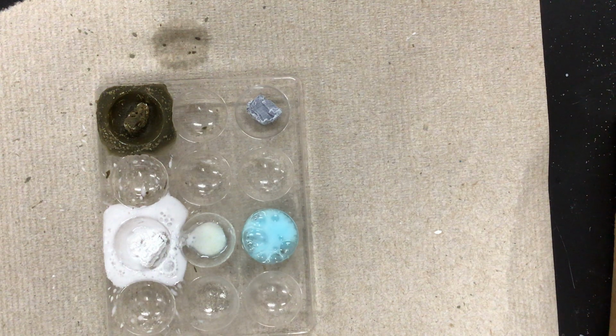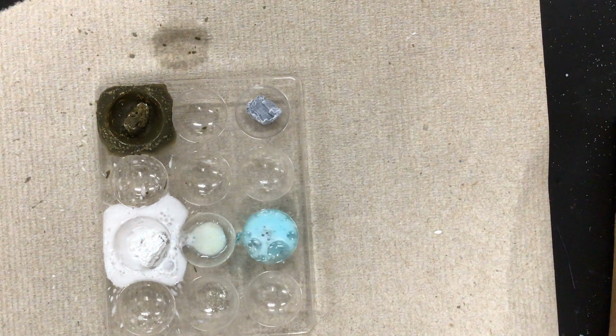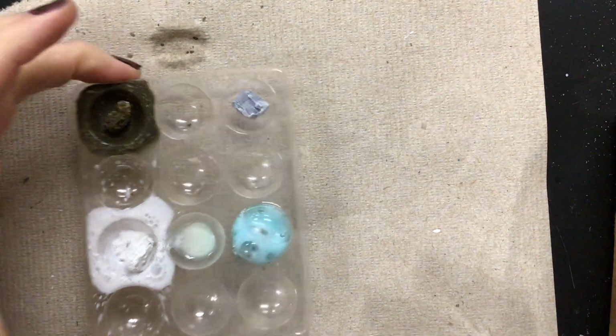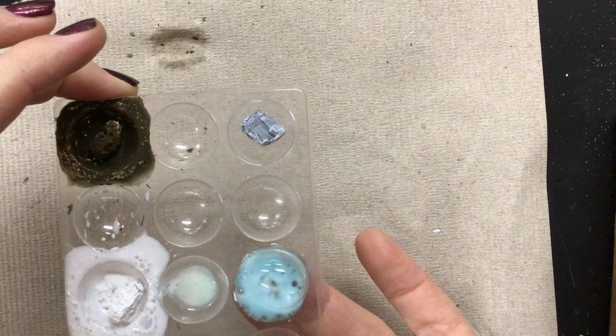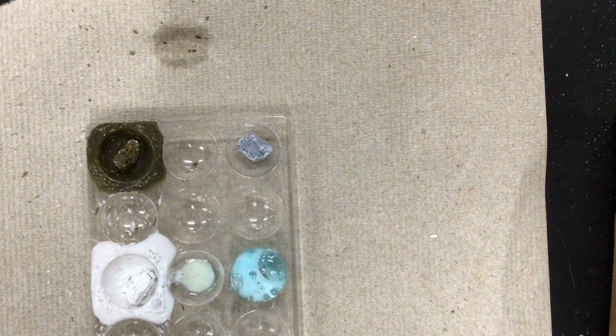That one is still going. There, we got a big bubble. That one took a while, but that one's getting pretty reactive as well. Wonder if that one will be hot on the bottom now. Yep, that one got hot finally. So that one's a very exothermic reaction as well. It just took it a while to get going.